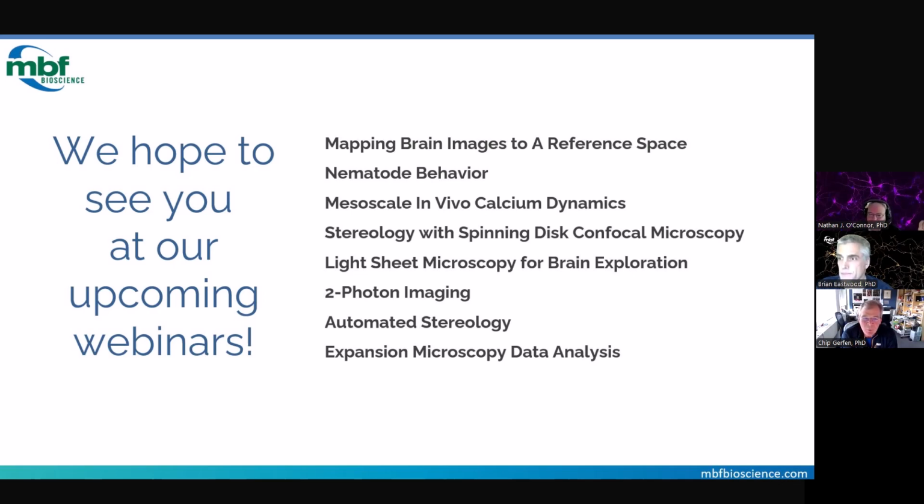This program is very good for reconstructing and registering. The atlas part is to be developed. And I believe other people have used BrainMaker for other organs. Even though it's named BrainMaker, people have assembled other types of tissue: kidney, lung, spinal cord, gut.